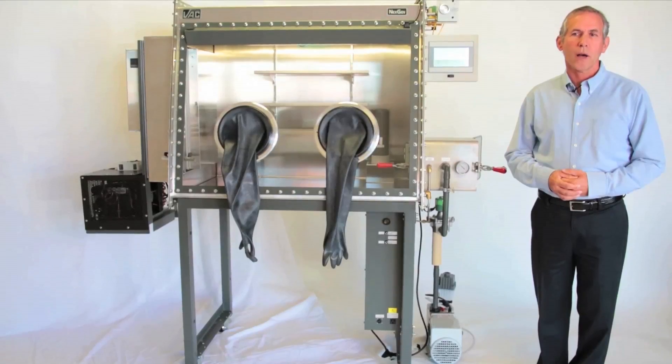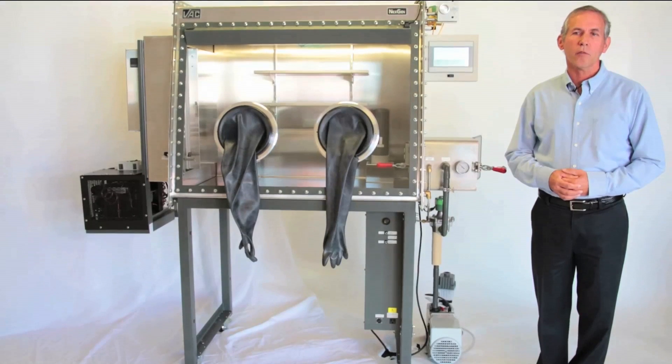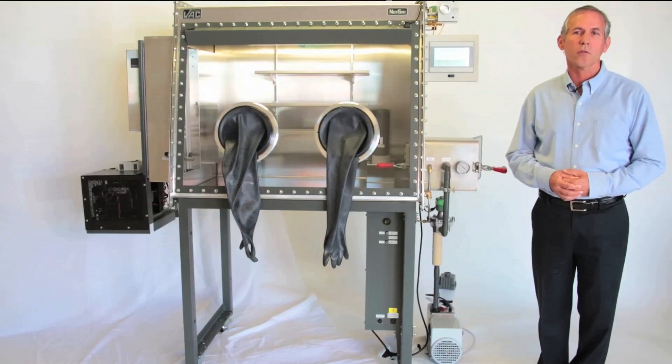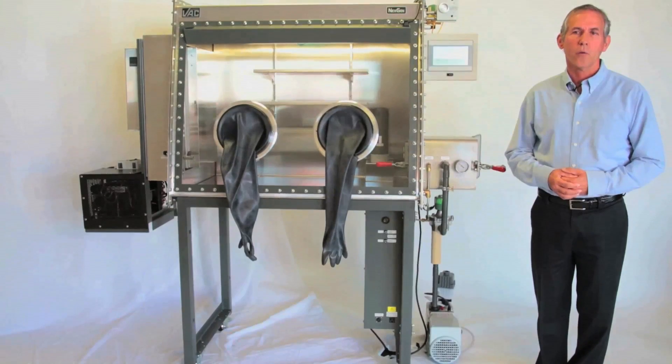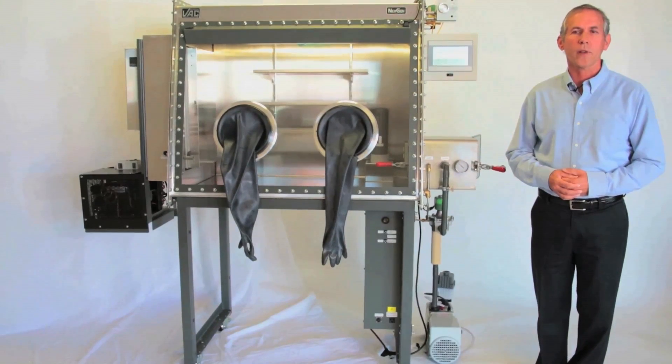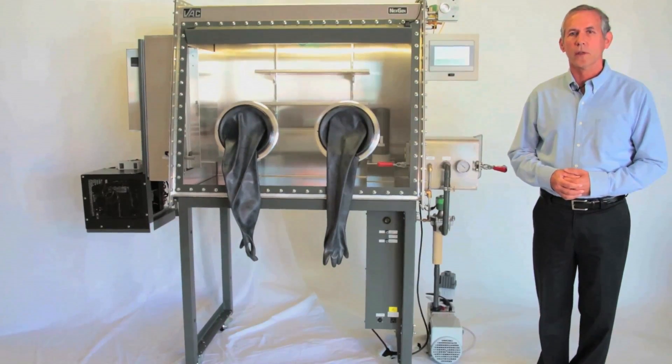Unlike traditional glove boxes with a single blower, the NextGen has separate, independently controllable circulation blowers for oxygen and moisture, which provides a level of control and flexibility not previously achievable.